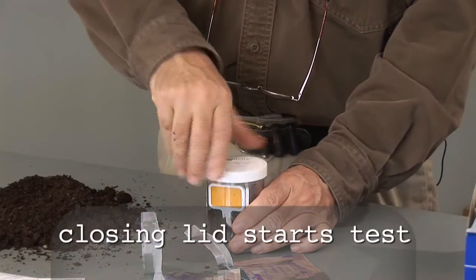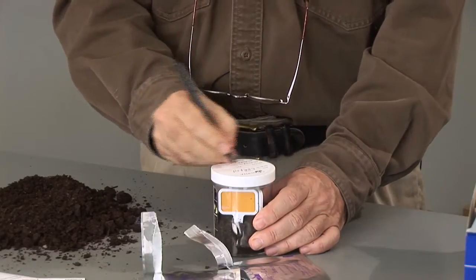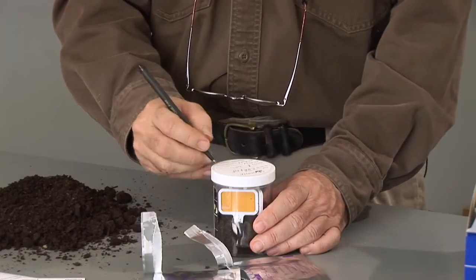The test begins when you put the lid tightly onto the jar. It's a good idea to mark the start time and the identification of the sample on the lid so that you know when four hours will be completed.